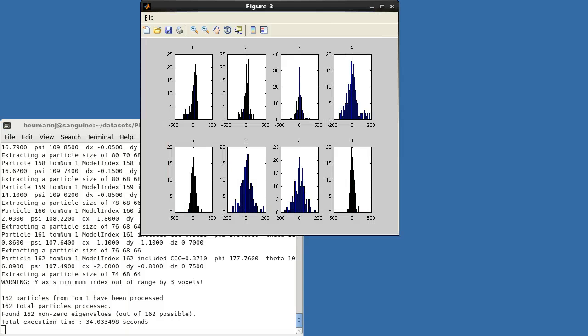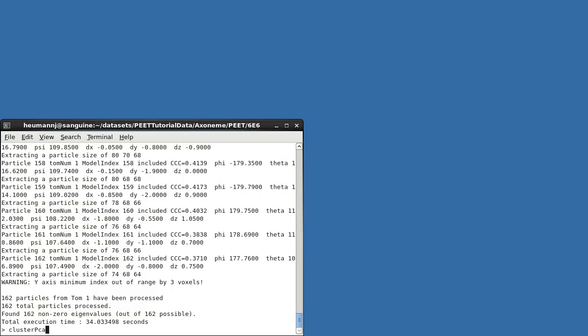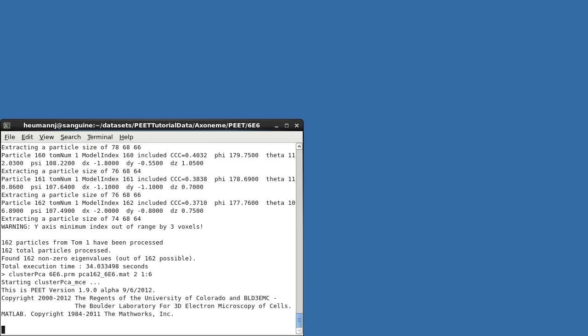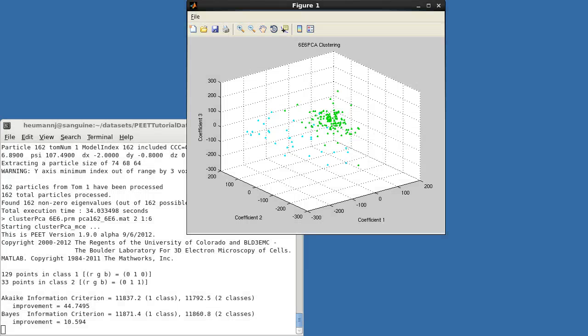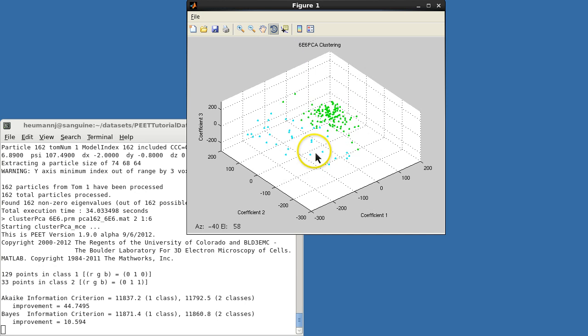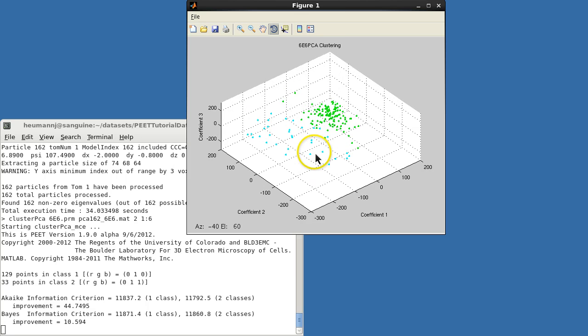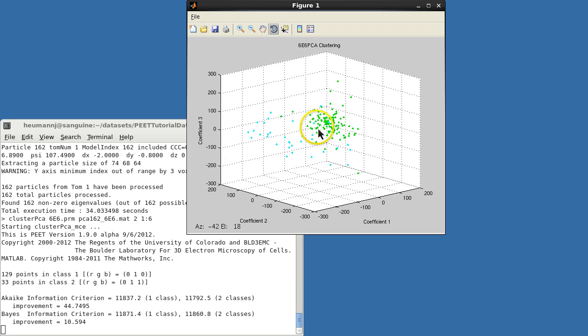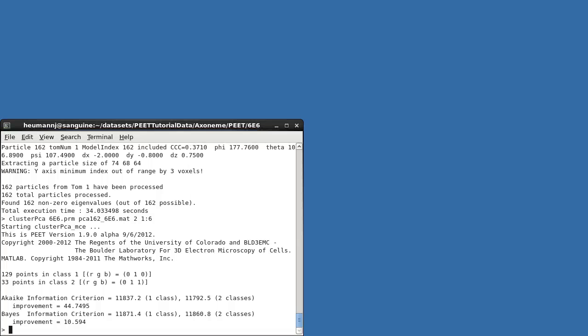I'll run two-class clustering using features 1 through 6, and you can see that both AIC and BIC indicate significant improvement over a single class. Class 1 in green appears relatively compact, while Class 2 is quite variable and may itself be heterogeneous. Because there are so few points in Class 2, we won't try to subdivide it any further, however. Now we'd like to see what the averages of these two classes look like.